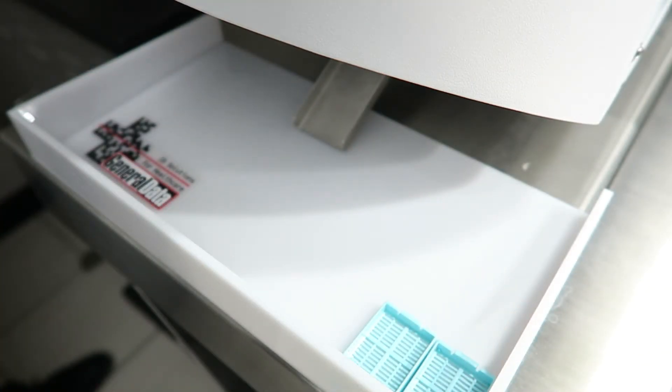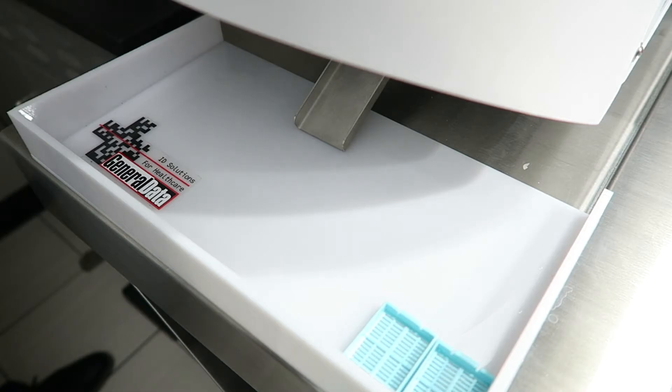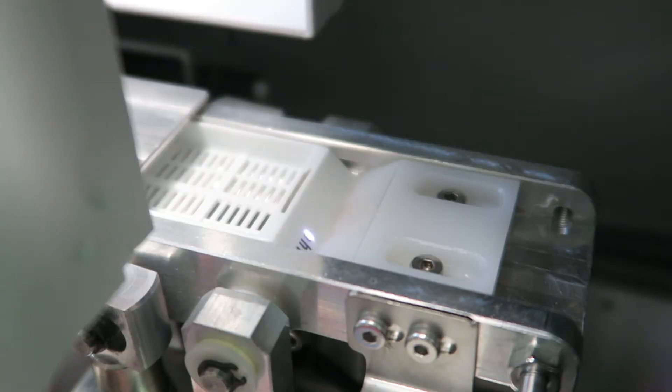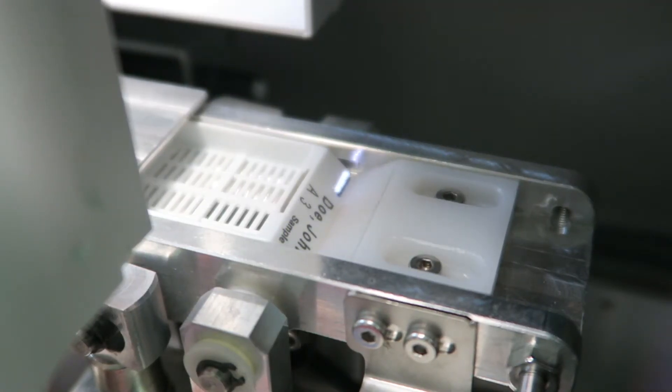The PH6 prints cassettes at a rate of about 1 every 3 seconds. The simple internal feeding mechanism greatly reduces the possibility of cassettes jamming in the printer.